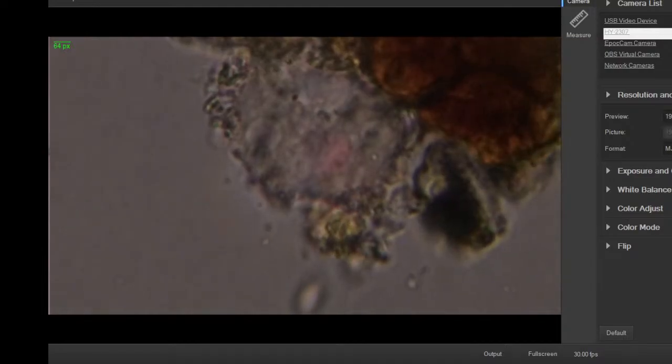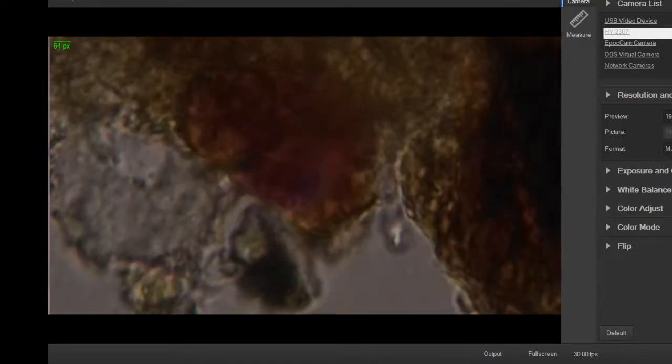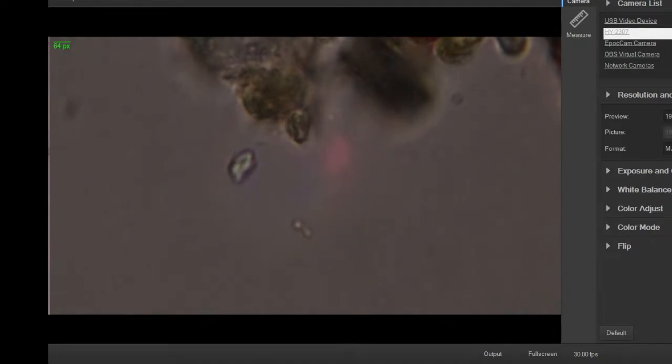There's some bacteria there. Look at that. So cool. This thing is so unforgiving with the movement. There's some nice Brownian motion, bacteria cruising around. A couple of spirilla types, little zigzags, lightning bolts. That's a big one there. That's a big bacterium. Look at that thing. Nice. This one's actually got some jerky flagellum movement there.